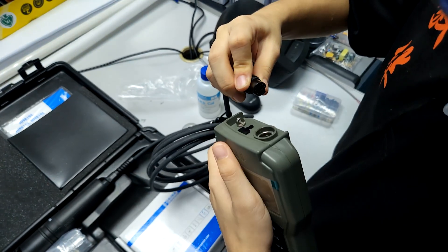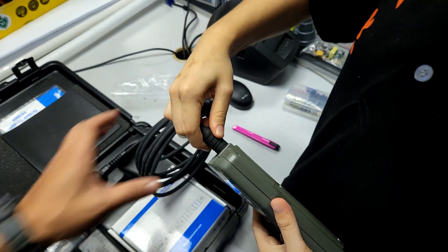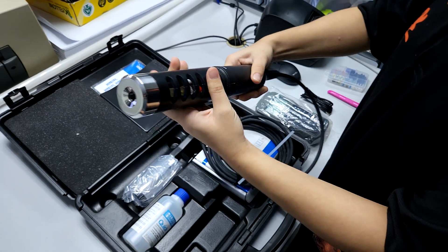The probes are actually a different unit, as you can see here, and you're supposed to connect them to the top. There's a keyway to get a secure connection. I would be extra careful when dealing with this, as some problems tend to occur at the top layer.